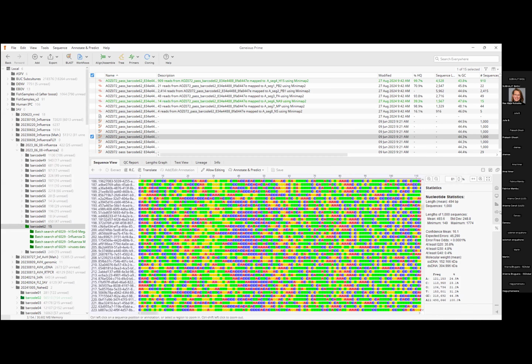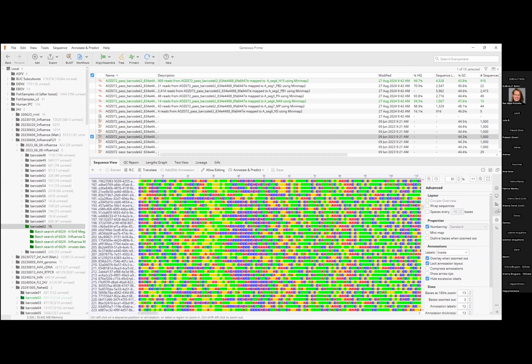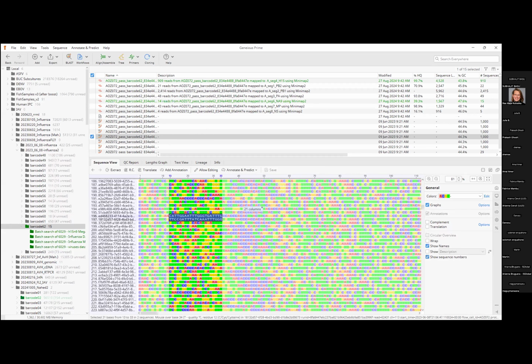Here on the right side, you can see the basic parameters. You can change whatever you want to change. You can annotate. You can display it in a way that it's easier for you. So you can change the color coding. You can see base quality, the GC content of your sequences, the melting temperature, so all kinds of things. So you can just read out here on the right side. I'm not going to go through all of them because it really depends on what you're looking for. Okay. So this is the basic setup. You have your folders, you have the sequencing data and the visualized sequencing data, so all of the text that you want to work on.